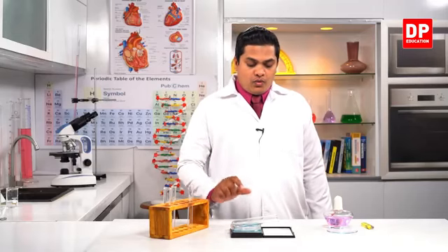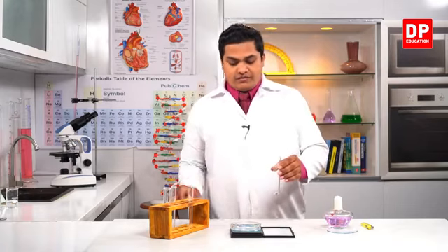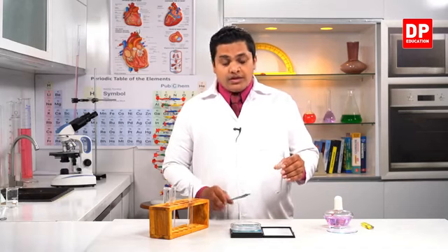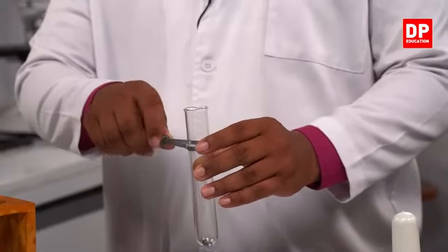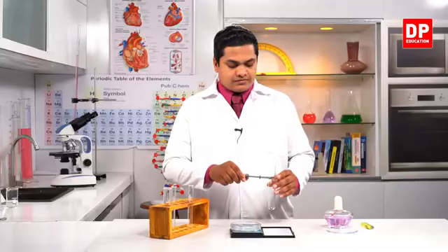Okay, so now I'm going to take the boiling tube away, and what I'm going to do is heat this up and burn all the matchsticks inside the boiling tube. Let's heat up.